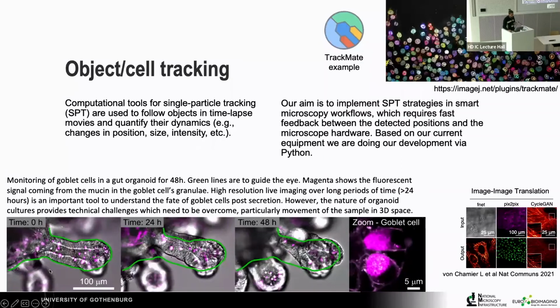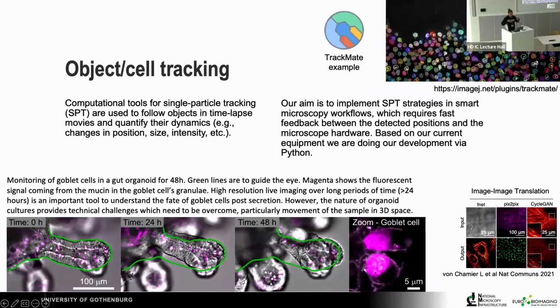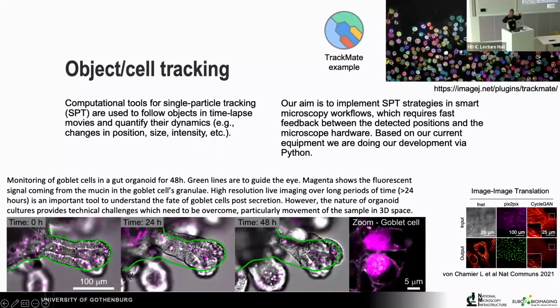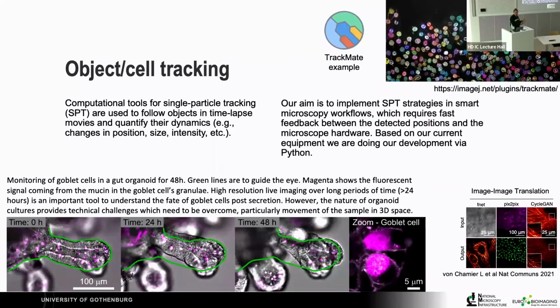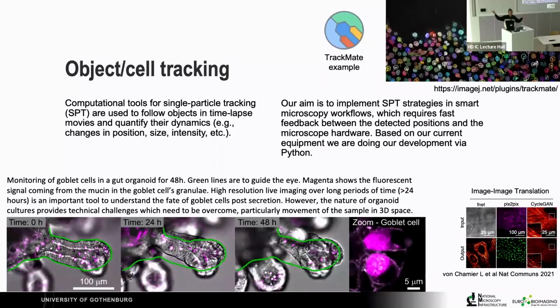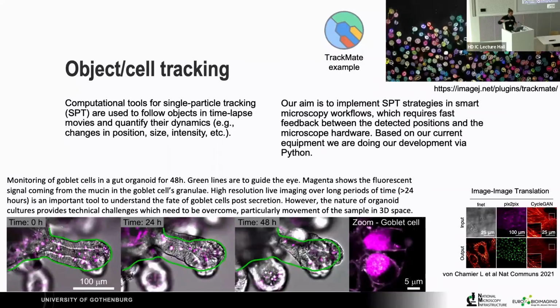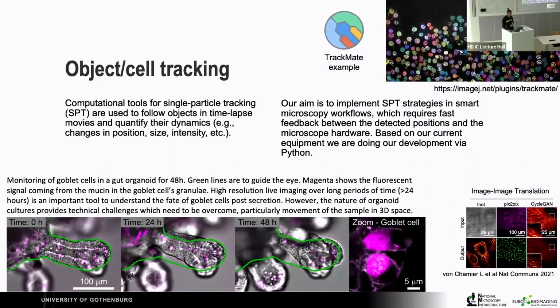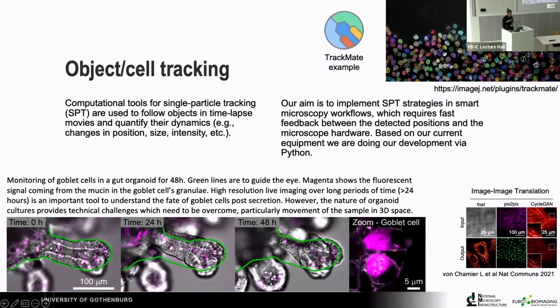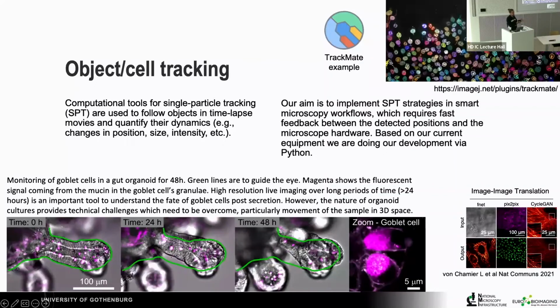So one of the big challenges there is that in these models, of course, they are three-dimensional, they are large. We have to be able to go and reach them with our microscope, but at the same time, when we trigger the biology that is interesting, these organoids move a lot, right? They do fantastic things, and then we have to follow and adjust and try to follow these arms. And at the same time, depending on what we are interested in, we might have to see at different resolution levels.